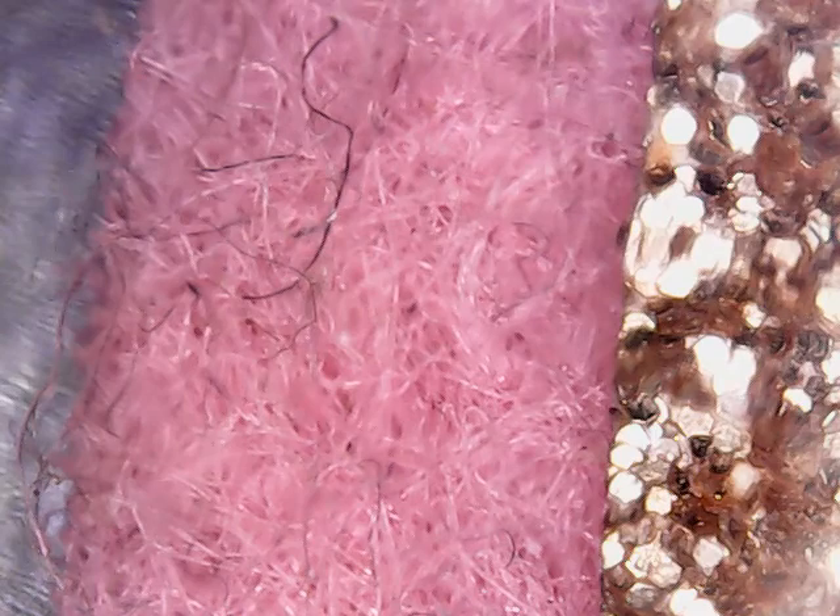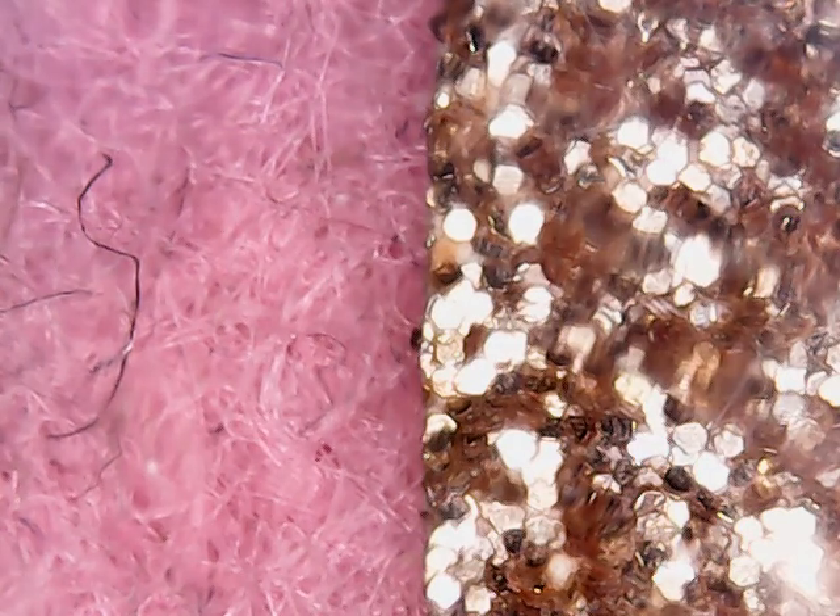Go over the side — oh wow, that's interesting too. I'll try to split it halfway down the middle between them. That's actually pretty straight up. But look, you can see — normally the pink side looks completely solid, nothing like that tangled mess of fiber. But it normally looks completely solid, and when you look at the glitter side, there don't seem to be black spots ever — it looks a lot more uniform than that. But wow, that's just interesting to look at.